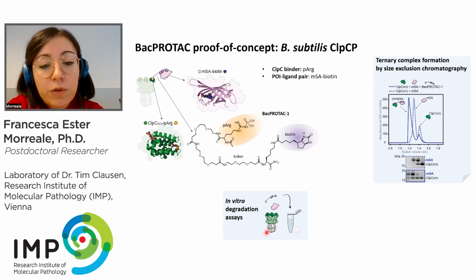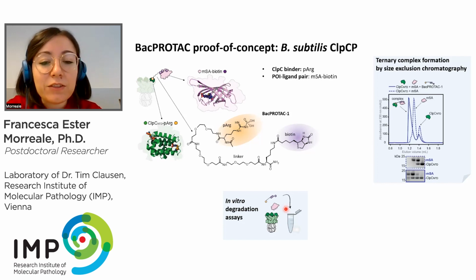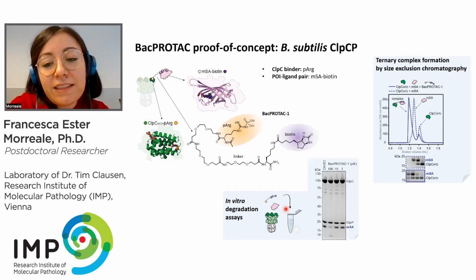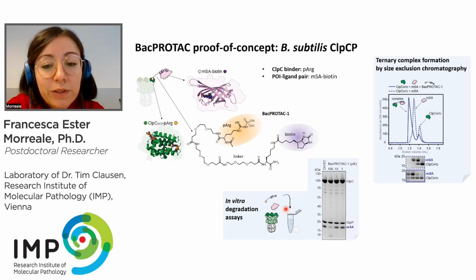In this in vitro assay, we mix together protein components that we purify recombinantly. And here again, since it's about tips and tricks, be careful with the salt concentration, the pH, and adding an ATP regeneration system. And we then analyze this assay by just running it on a gel and staining it with Coomassie. So here you can see all the proteins. So I think this assay is very powerful, also because you have internal controls.